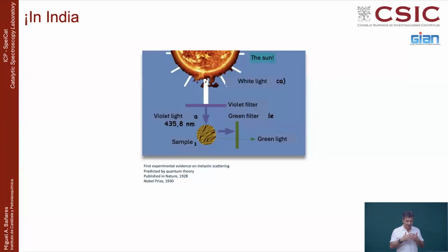And what he was using is something like this color plastic paper, whatever it is, I don't know the English word for that. Cellophane, maybe English word? Maybe, I don't know, but these are like papers that you can see through them. They are very transparent and they can be made of specific colors. So basically the light coming through this paper will only be that color.